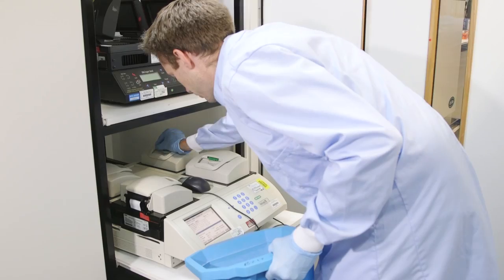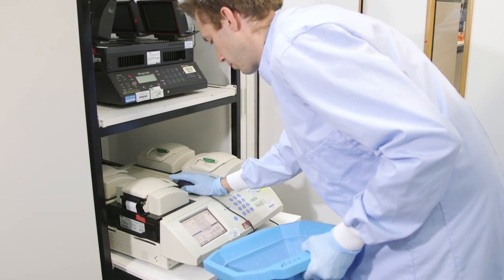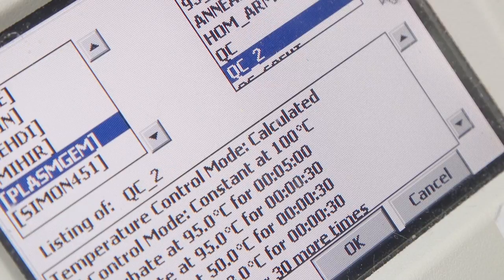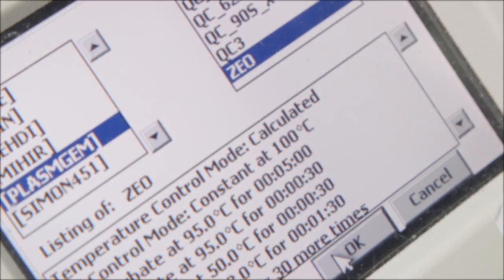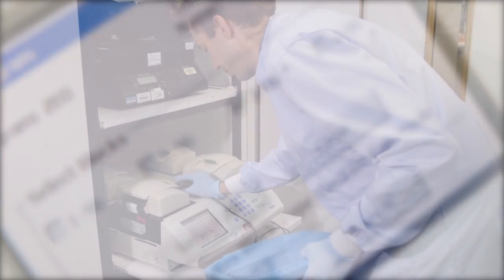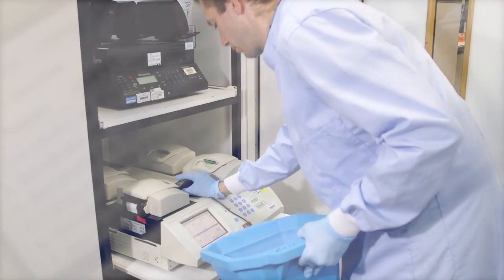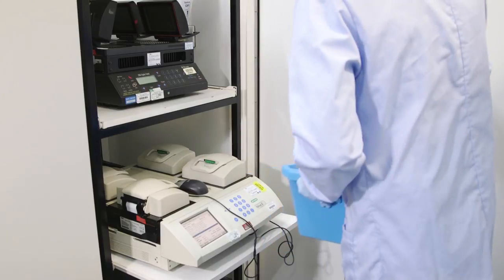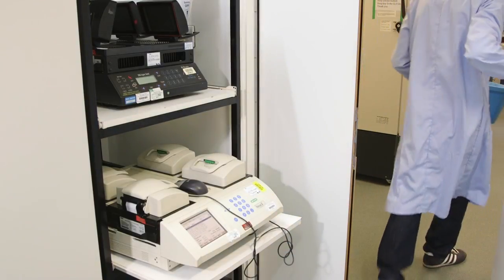Now each well contains DNA fragments with the same resistance marker genes, known as a resistance cassette, but the ends of these fragments differ and those will later guide the finished vector to specific target gene in the parasite. These ends are the oligonucleotides we designed earlier.